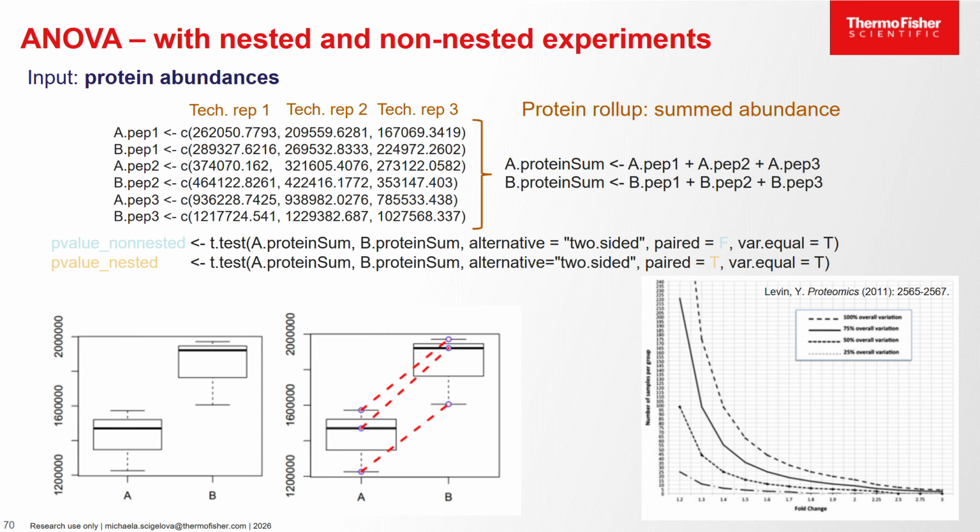So this is what we would recommend as well for the ratio change 2 to be considered significant. If your data have much higher variation, you can read from that graph very easily how many more technical replicas in the sample group you would have to have in order for two-fold change to be statistically significant. The numbers get quite staggeringly high very quickly. If you have very nice data, high quality, low overall variation, you see that, for instance, with 5 sample replicas and the overall variation of up to 25%, you might actually already consider a fold change ratio of 1.5 to be statistically significant.